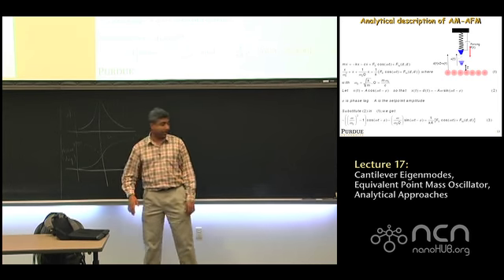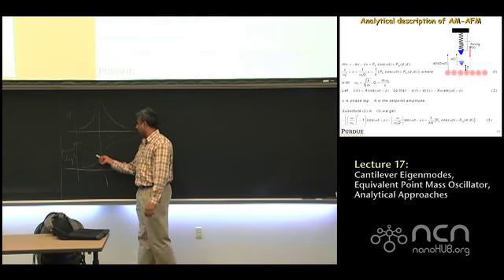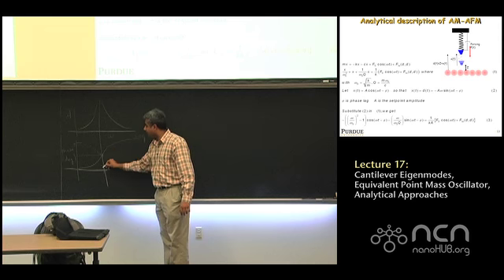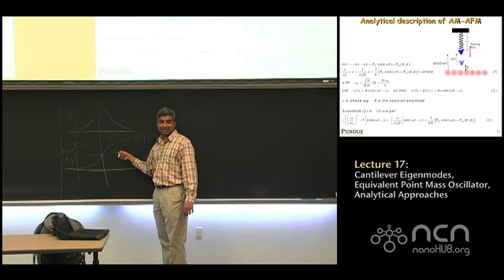Another important thing, as Ron just pointed out, is often you have to center the phase. At the peak, you have to click on this curve and make this point equal to 90 degrees, or minus 90 degrees. If it's phase lag, you would call this point 90 degrees.